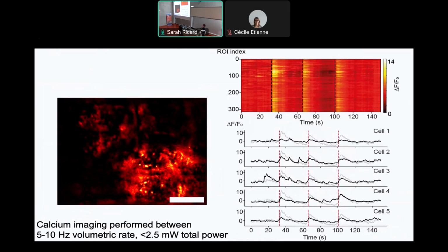And what's really interesting about zebrafish larvae is that just before they move, in fact, you get this whole brain wave of activity. It's almost as if in anticipation of motion, the brain says, come on, let's go, we're ready. And so you get these huge waves of activity. You can see that these are the traces from individual neurons in the brain, and just before the fish moves, you get these huge increases in fluorescence, which is a sign that the fish is just about to move.